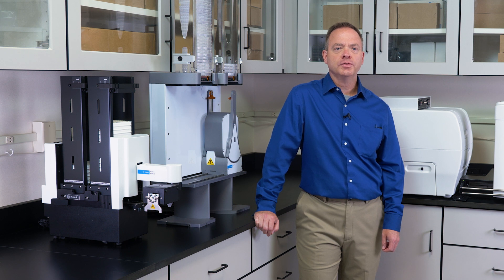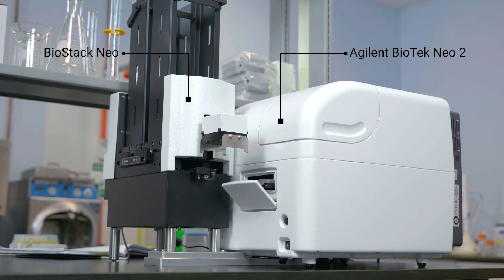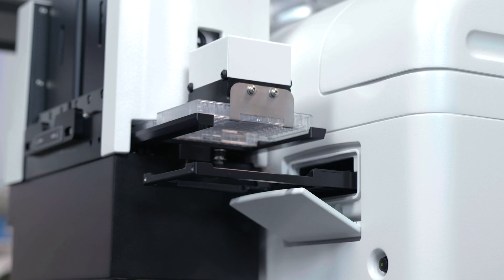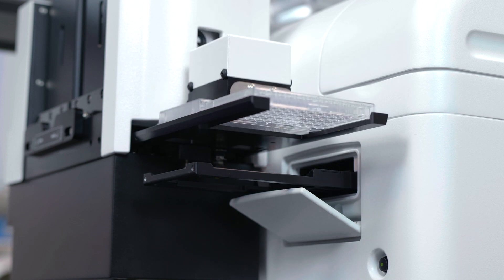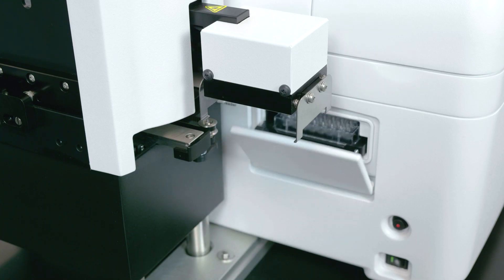BioStack models offer a number of advanced capabilities, including fast plate transfers to and from the integrated imager, multimode reader, or liquid handling system, including BioStack Neo, which was specifically designed to integrate with the Synergy Neo2 for the fastest plate processing to meet any high throughput screening requirement.